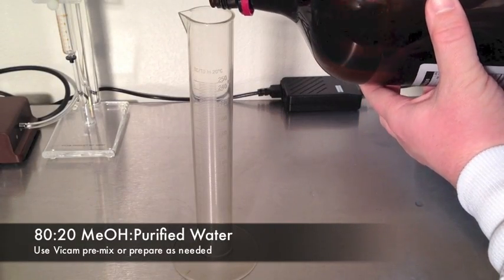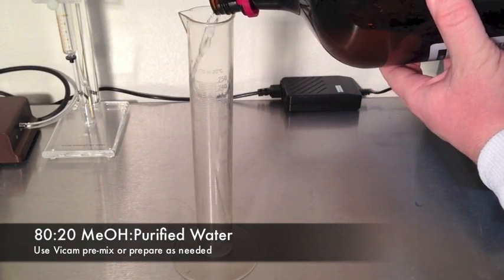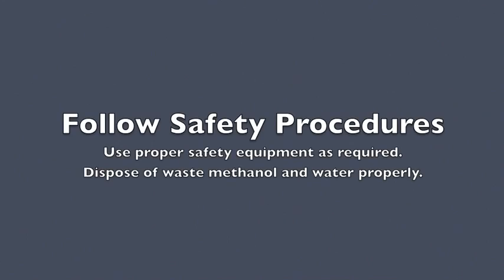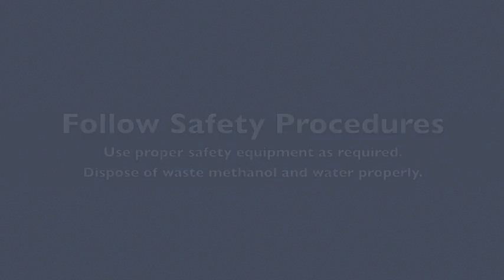This test requires an 80-20 methanol mix. Always follow standard laboratory safety procedures and use proper safety equipment as required. Follow all appropriate laws regarding disposal of waste, alcohol, and water.